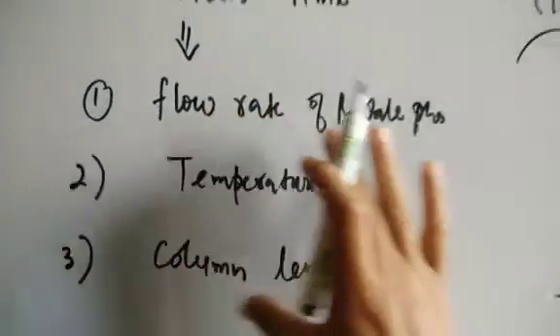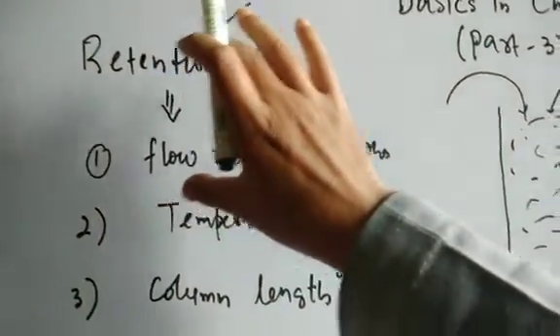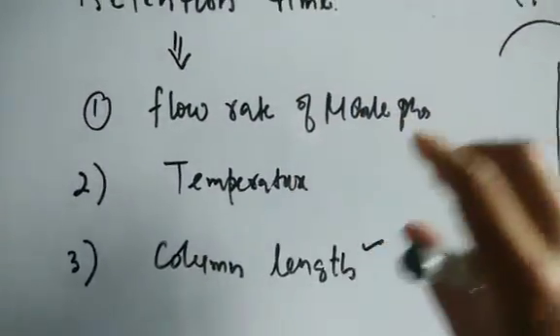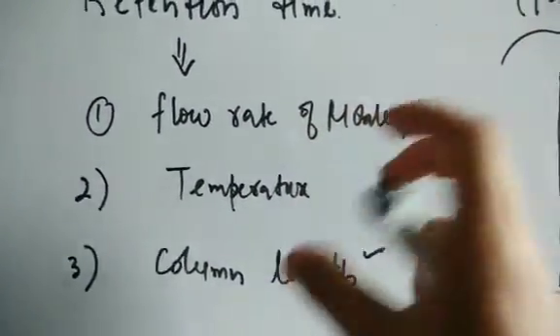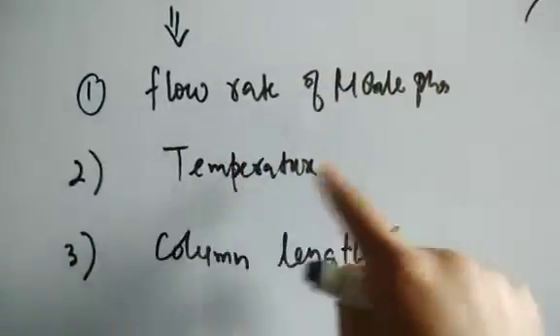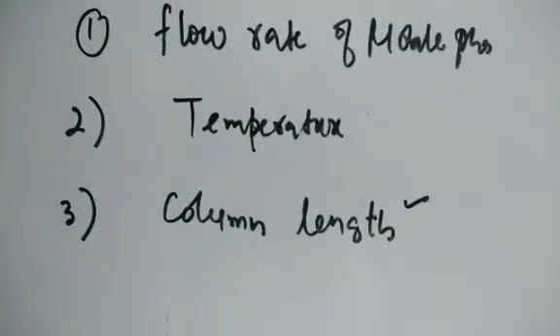So ये तो हो गई 3 factors जिस पे किसी भी chemical compound का retention time depend करता है. अगर आप एक ही experiment करोगे in 2 different periods of time, तो you will have some difference in the retention time because of these factors. ठीक. उसके बाद we have some more terms here.